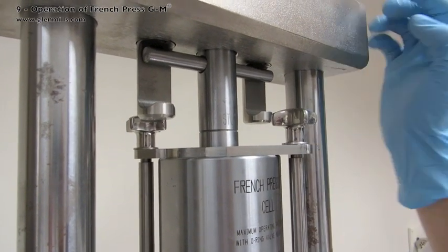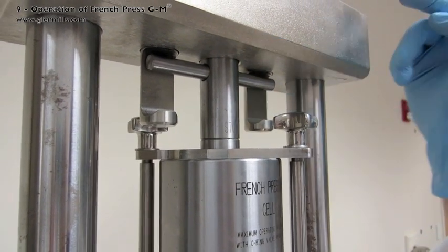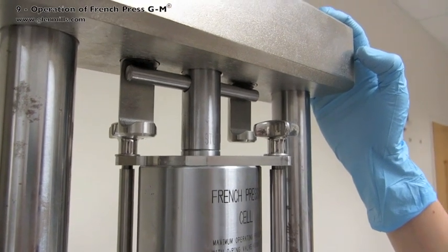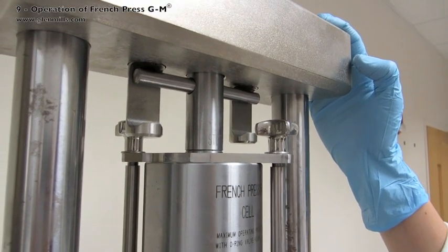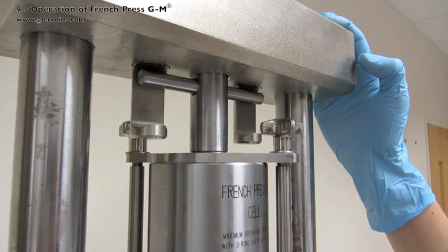Keep watching the piston stop marking. When the stop line reaches the cell body, switch to pause. Though there is an internal cutoff safety switch, the user must be ready to shut the system off. The run is completed.